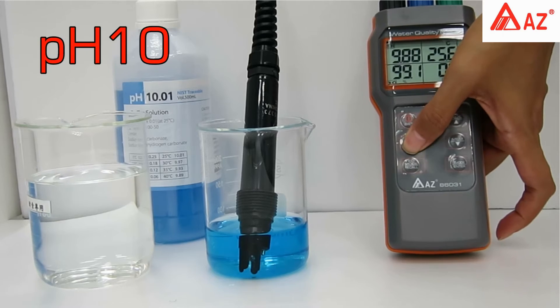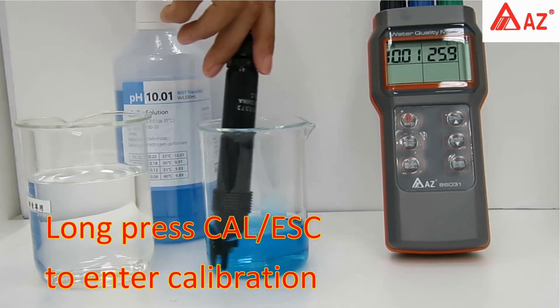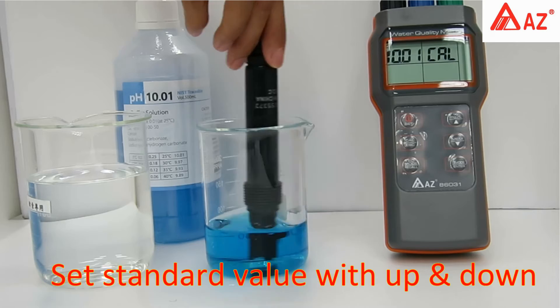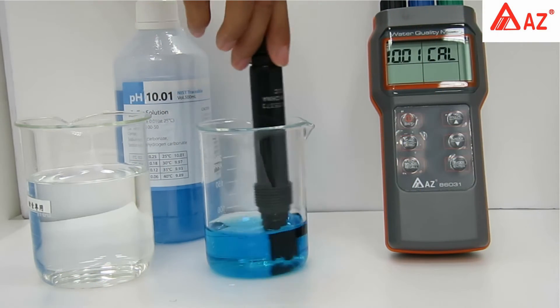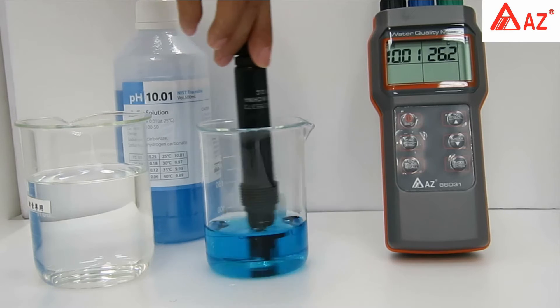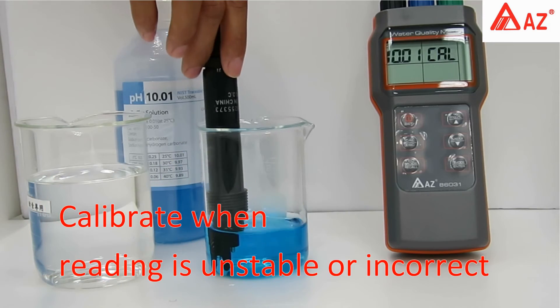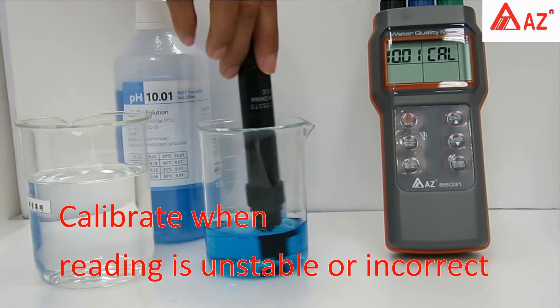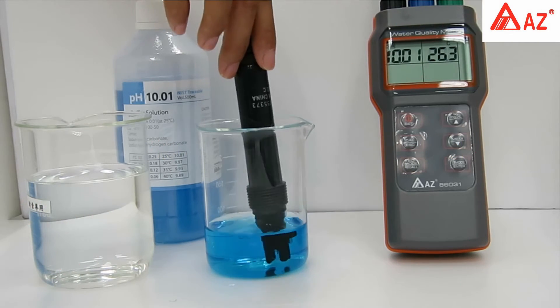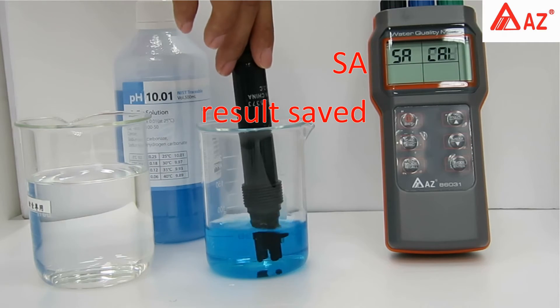For pH 10, change to pH mode and long press Cal to enter calibration. Set the standard value using the up and down keys. Use a transparent container and make sure the pH electrode is completely immersed in buffer. Stir gently for a homogeneous condition. Do not reuse standard buffer. Once the reading stabilizes, press Enter or wait for the SA icon — the result is automatically saved.